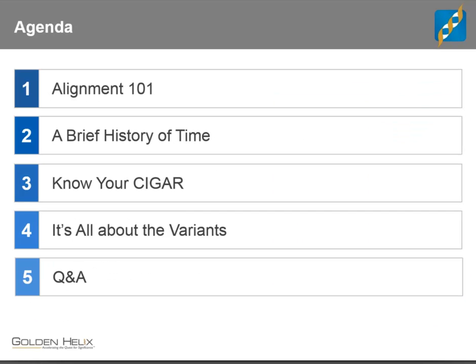What I'd like to cover is an overview and then a deep dive into alignment algorithms, and then come back up and talk about where they fit in the overall pipeline. We're going to start with a basic overview of alignment algorithms, and I'm going to do this in an interactive way by showing you some of the results of an alignment algorithm, going into a visualization where we can talk about some of the details we'll be learning about today.